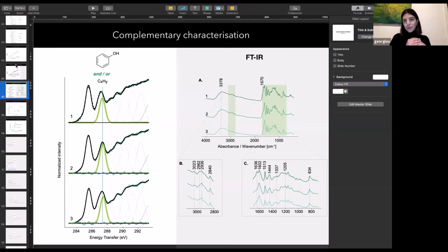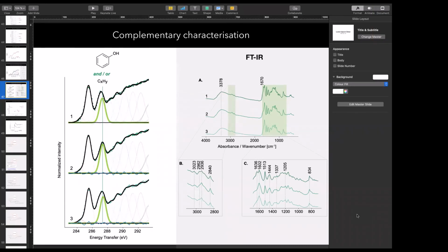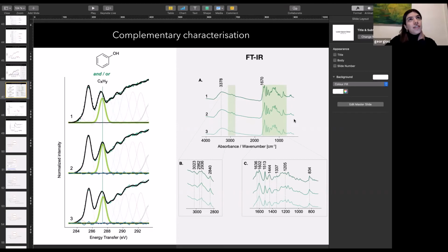The problem comes when you want to detect the carbon K edge, like the energy transfer at the carbon K edge, but you have the presence of other elements, so you have a heterogeneous sample. So how would elements like calcium already impact on that? Thinking about cultural heritage materials. For example, I have an example in mind.